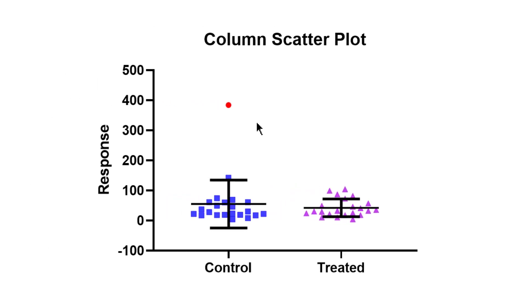So that wraps up the video tutorial for scatterplots. In this tutorial you've learned about plotting scatter graphs in Prism and how to interpret and create both an XY and a column scatter graph. Scatter graphs are great when you have modest amounts of data points to easily visualise them all on the same plot, providing a lot more information to the reader instead of just plotting summary data such as bar graphs.